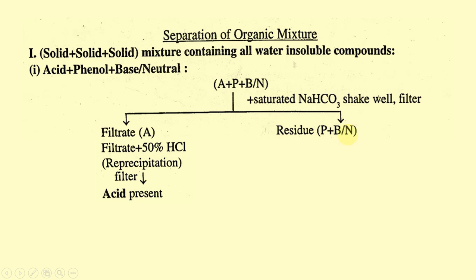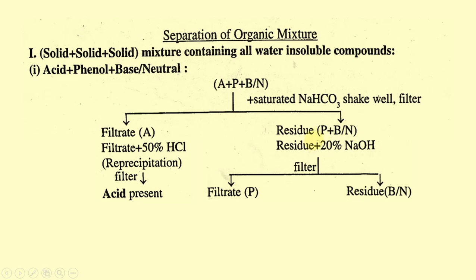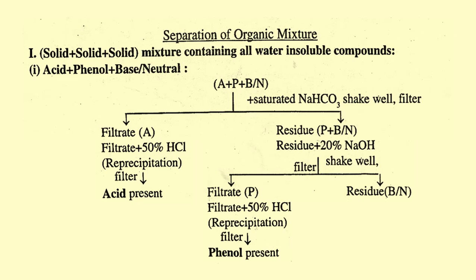And then the residue has two compounds, a three compound mixture, solid, solid, solid. These are water insoluble compounds: phenol, base and neutral. Further, residue plus 20% NaOH, shake well and filter. The filtrate on addition of 50% HCl gives reprecipitation, then phenol is present, and the residue is base and neutral.